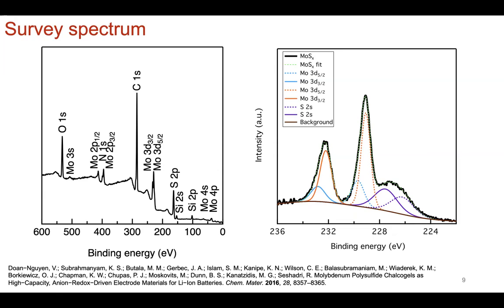So while this is sufficient in terms of the deconvolution of the peaks to quantify the amount of sulfur to molybdenum species, the fact that these two overlap also makes it less than ideal. So there you would try to find another sulfur edge, say, or another binding energy. I said edge. Another binding energy.